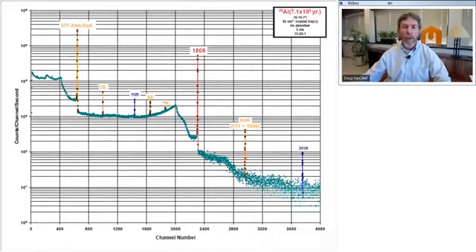On this slide, we see a nice collection of spectral features just from the decay and gamma emissions of aluminum-26. We will discuss each of these features one by one, using a simple review of the physics of the measurement process as the reason for the appearance of the feature in the spectrum. You may wish to note that the INL Spectrum Catalog has a horizontal axis in units of channels, with the peak energy values in keV listed on the spectrum display itself. With that, we will start with the physics principles now.